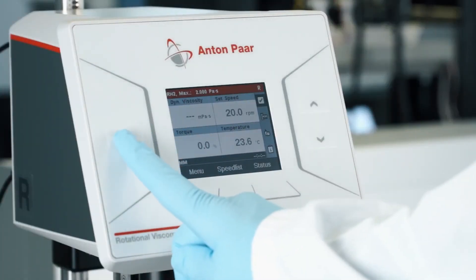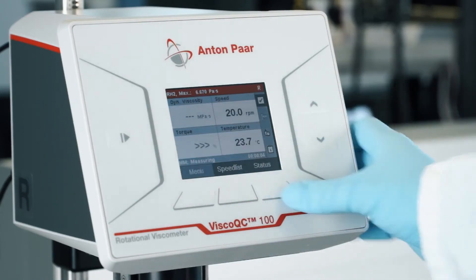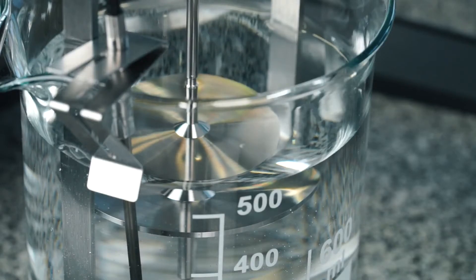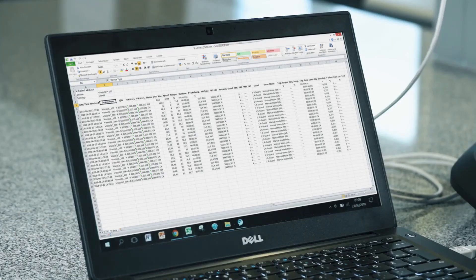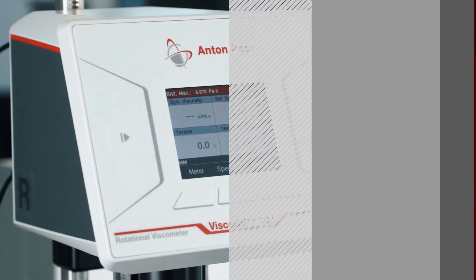To start your measurement, tap the button on the left side and make sure to measure in the valid torque range of 10 to 100%. If you are outside of the range, choose another speed from the speed list. Tap the button on the left side of the screen again to stop the measurement. If a computer is connected to Visco QC100, the data is automatically sent to the vCollect software. Tap Home to get back to the start screen.